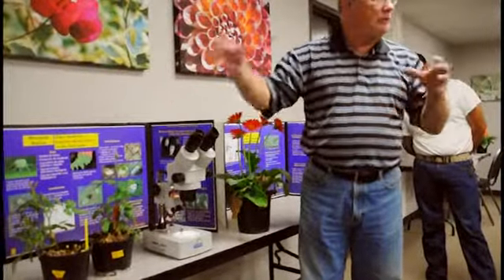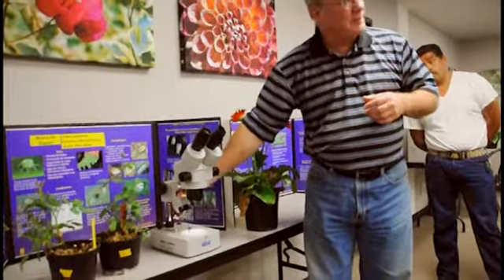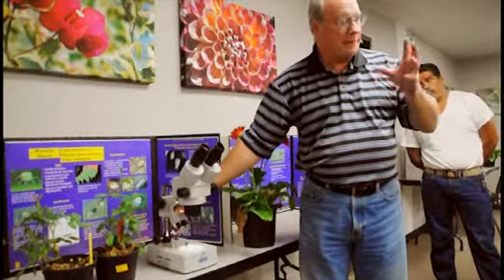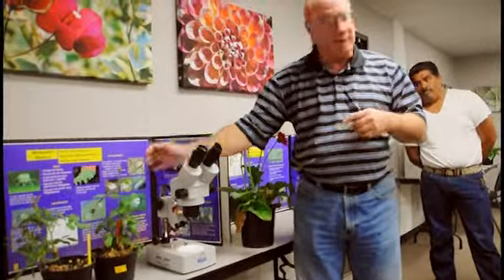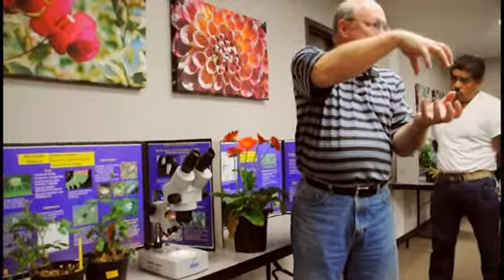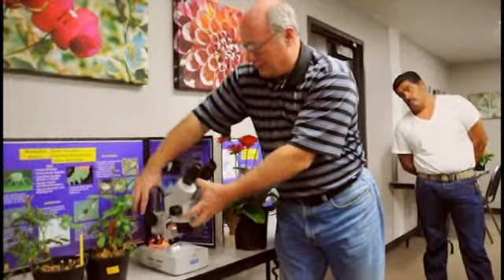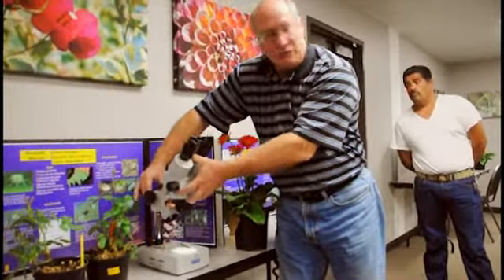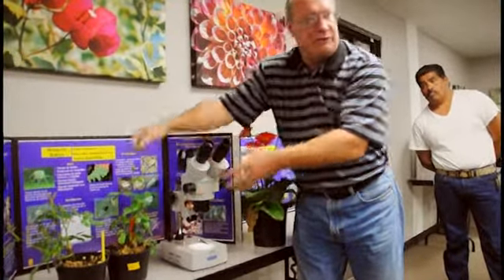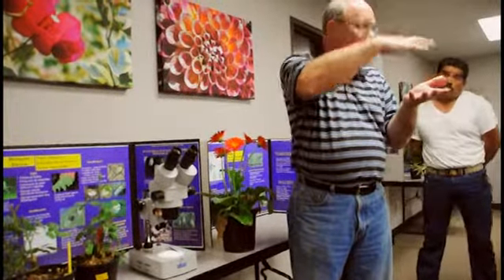Once you zoom to the size you want to see, then in the back here, this big arm will focus the image so that you can see it better. So up and down focuses the image. And lastly, if there's an insect that's up high or there's a plant that's big, you can raise the whole thing by the knob in the back. You can actually raise this up high so you can change the height of the scope, so that you can still focus on the image on the plant. However high the bug is on the plant, you can focus on that.